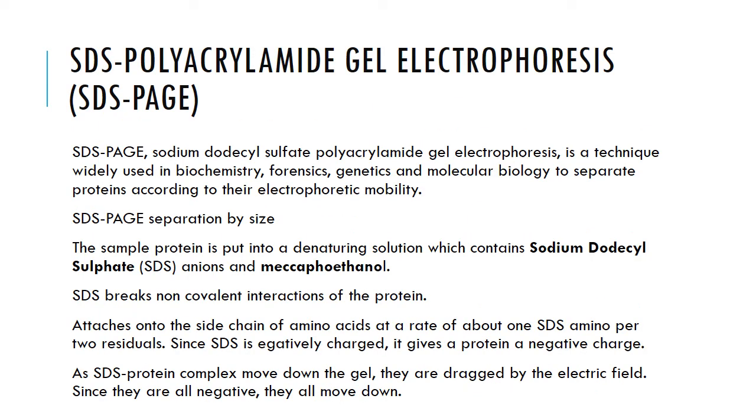Okay, so now we are talking about SDS. What is SDS-PAGE? We will briefly explain. SDS-PAGE is a type of gel electrophoresis that involves the usage of SDS, which is sodium dodecyl sulfate. Not social and development studies, but sodium dodecyl sulfate. Since an additional molecule has been introduced, the name changes to sodium dodecyl sulfate polyacrylamide gel electrophoresis.